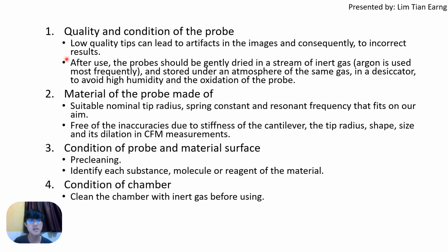And after using it, be sure that the probe is gently dried in a stream of inert gas and stored under the same gas in a desiccator to avoid high humidity, so that the oxidation of the probe will not happen. The second will be the material the probe is made of. The material is important and it depends on your choice of the material of the probe.